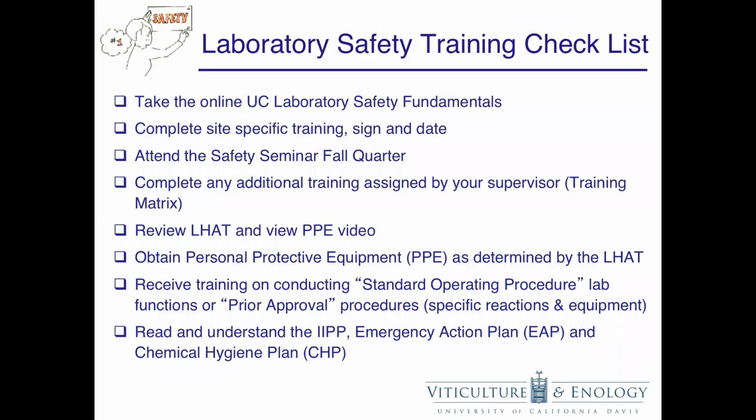Because working in a laboratory presents many various hazards, safety training must be completed prior to beginning any work in the lab. Personnel working in laboratories must complete the online UC Laboratory Safety Fundamentals, complete the site-specific training, attend this seminar, and complete any additional training as required by the lab which you will be working in. This additional training will be discussed later on.